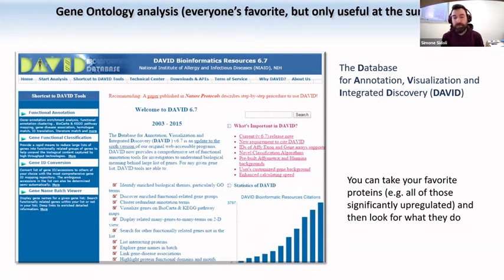You can do it, of course, but always remember that p-values are detectives. They are not judges, right? They are indicative numbers that suggest what is the probability that this is going to happen again. They are not the ones to decide the destiny of your sample.